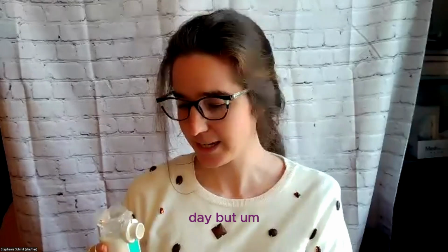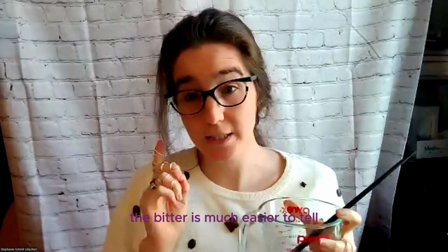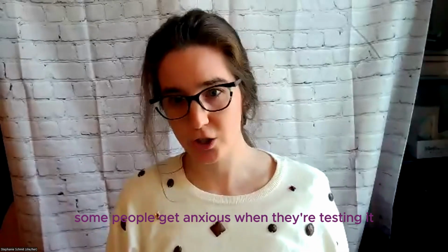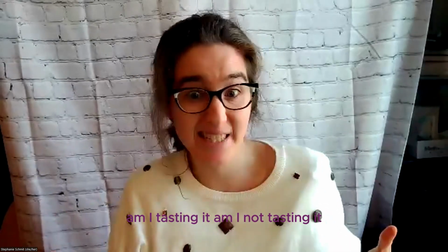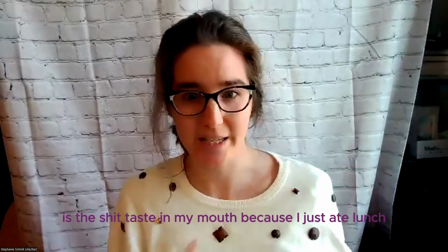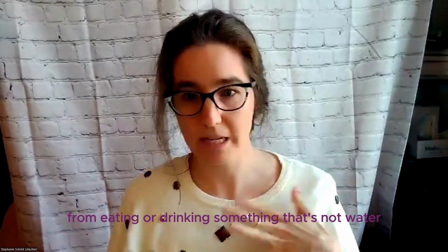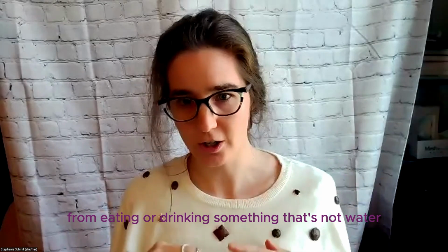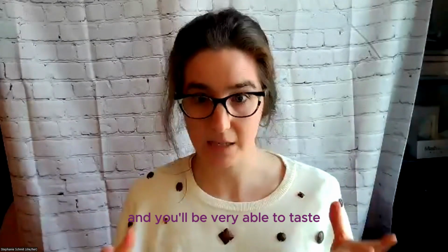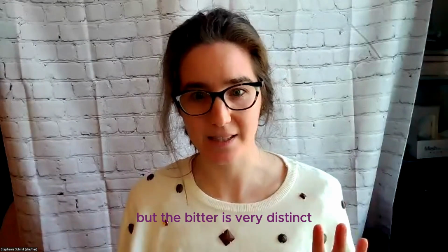But you can always check your nebulizer to make sure it's working with water. Bitter is much easier to tell if you are tasting it. Some people get anxious when they're testing it. They stick their tongue out. Am I tasting it? Am I not tasting it? Is the taste in my mouth because I just ate lunch? So you always need to wait at least 15 minutes after eating or drinking something that's not water, so that you can make sure that your mouth has no taste in it, and you'll be very able to taste either the bitter or the saccharine. But the bitter is very distinct.